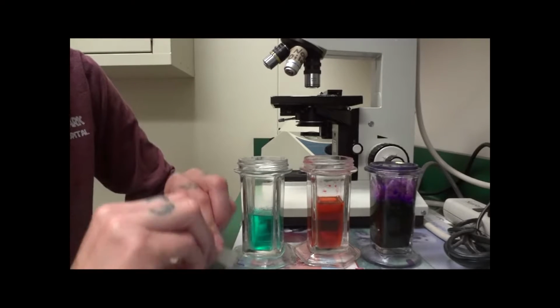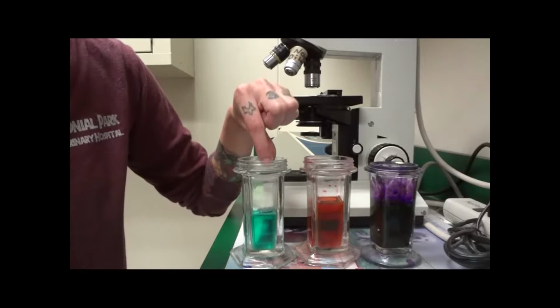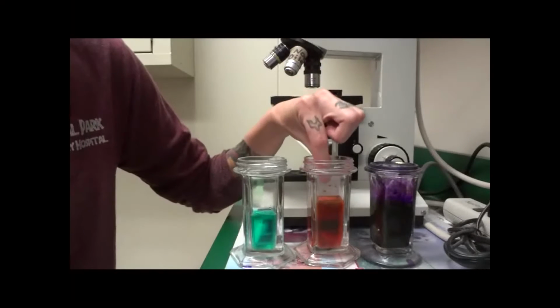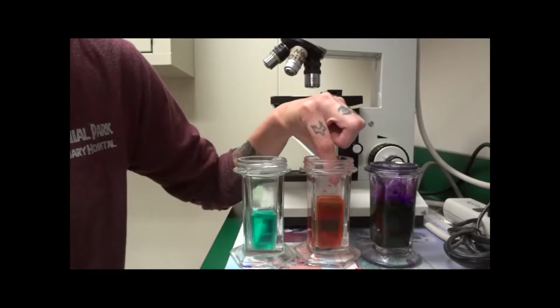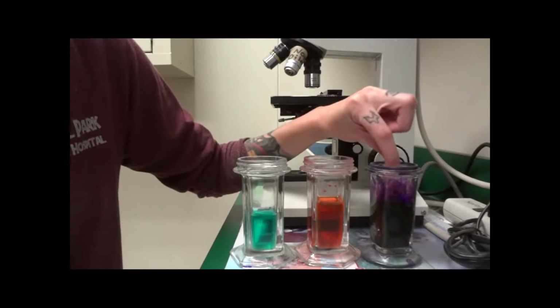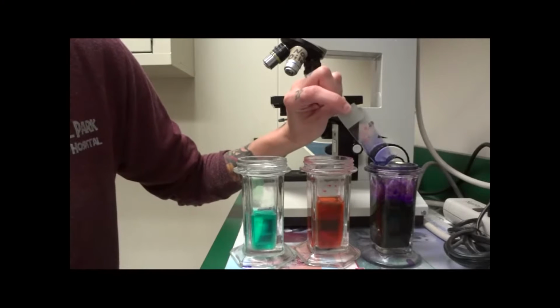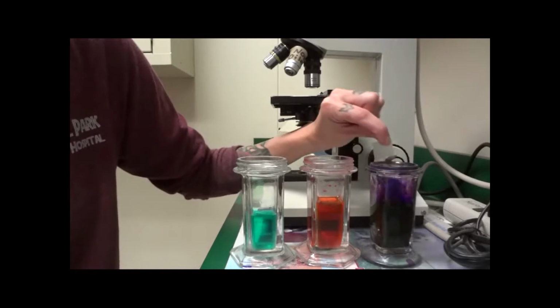Alright, now we will stain our vaginal cytology. First in the fixative, dipping it 5 to 10 times. Then into our red stain, which is the eosinophil stain. Again, 5 to 10 times. And last into our basophil stain, 5 to 10 times as well. We'll then rinse this with the distilled water, allow it to air dry, and look at it under the microscope.